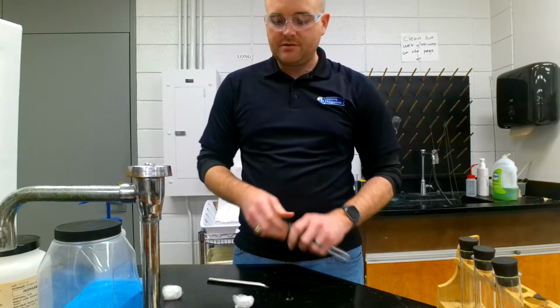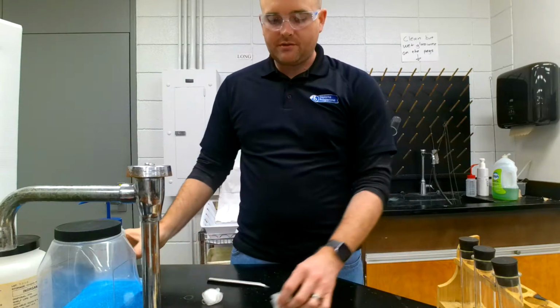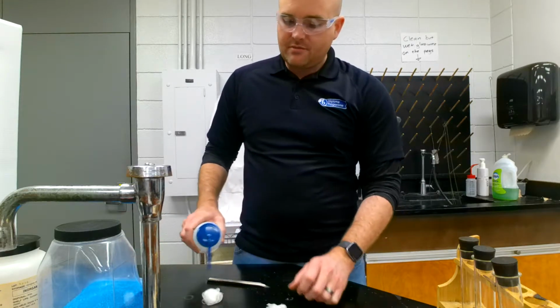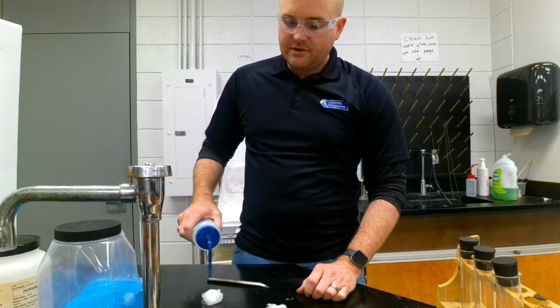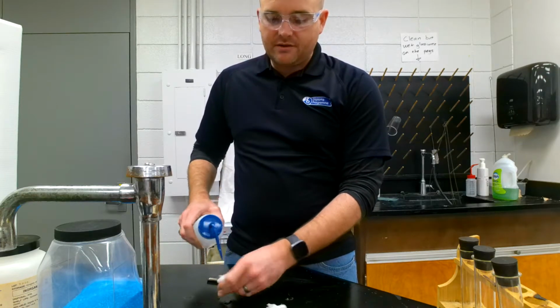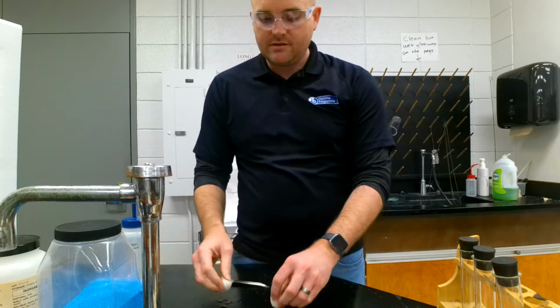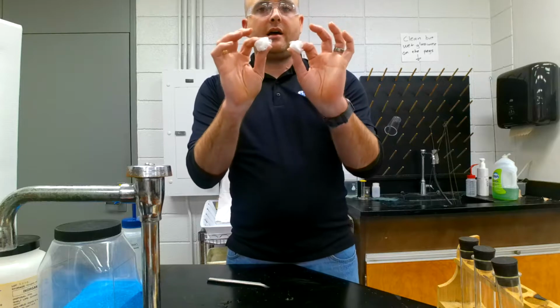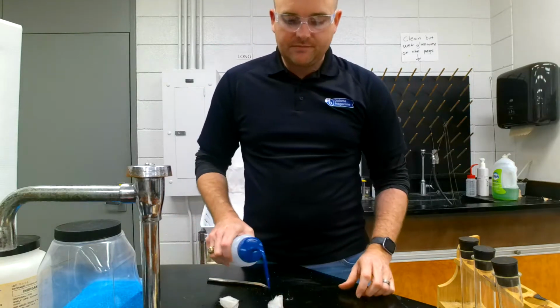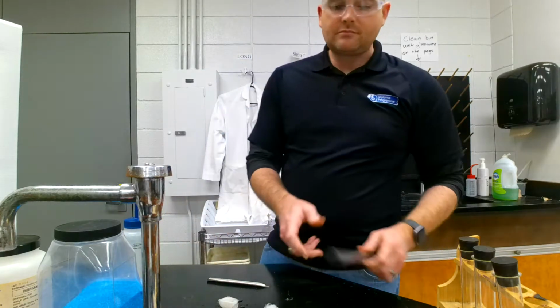So the first thing I'm going to do is take some cotton balls and soak them in water, just spray them down. Now these are actually not cotton balls, they're nylon, but they'll work the same. They're just trying to make a barrier so that the salt and the copper sulfate don't actually touch each other, but they're going to make solutions eventually, because you'll see. And so they're going to be wet.